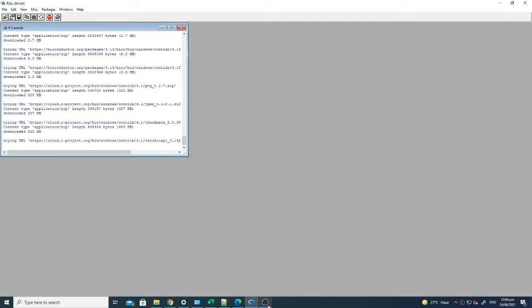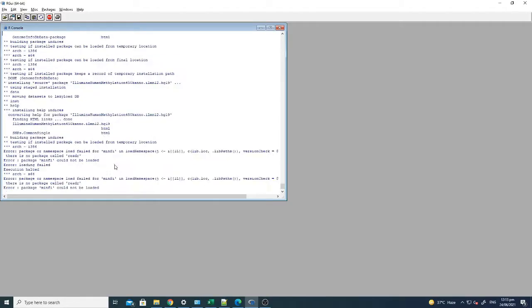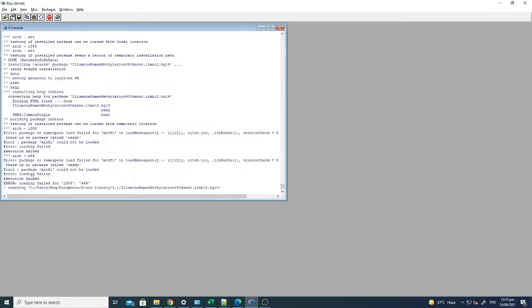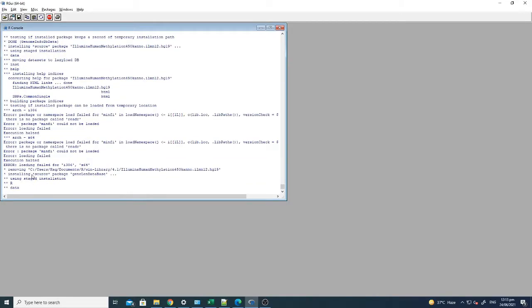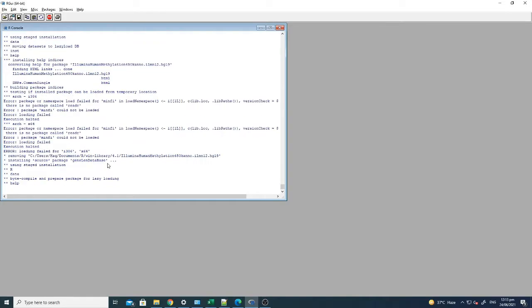It will take a few steps, and then in the next I'll show you how we can encounter some possible errors during installing the CHAMP software. Here you can see that all the packages were downloaded and then unpacked and installed, but there were some errors. For instance, you can see there's an error in loading the minfi package, and that's showing there are problems. All the dependencies of this package are also not installed, and all of them are showing errors.